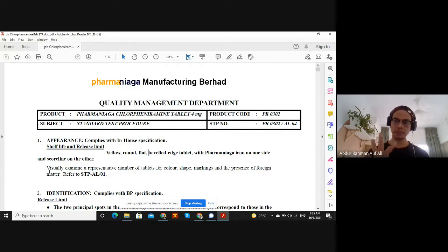Okay, so to limit the error, untuk kurangkan risiko buat kesalahan ataupun risiko di mana wujudnya ralat, kita akan select one method sahaja untuk dimasukkan dalam standard test. Kita gunakan for routine use. So this is how a standard test procedure is created.